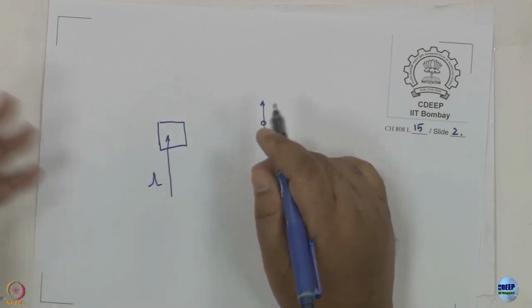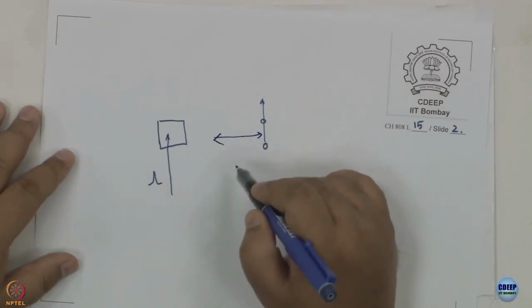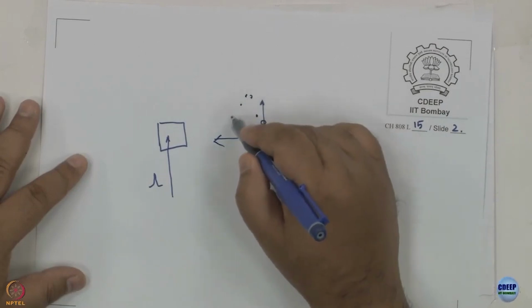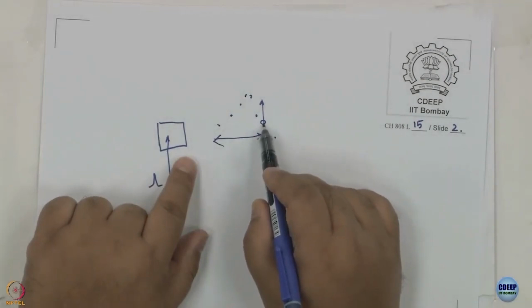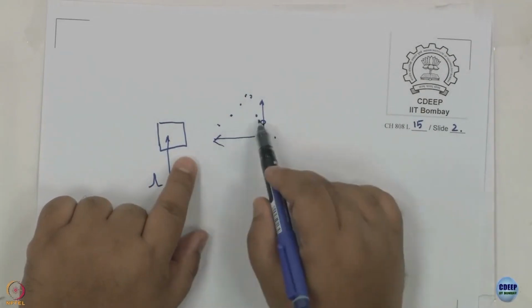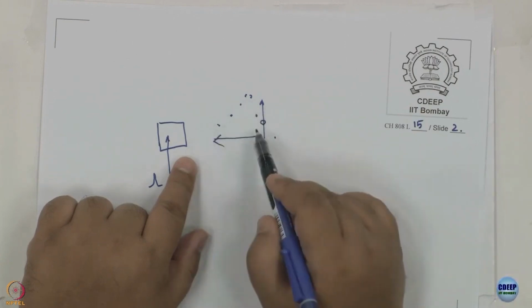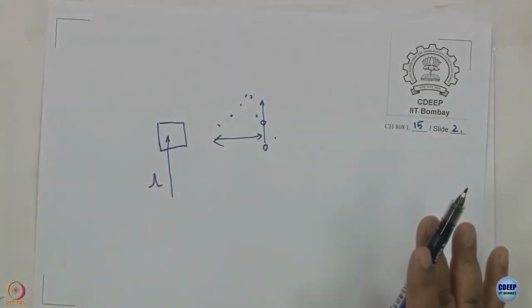When I say slower, I do not mean the photons are running slower, I mean they have been emitted at a longer time post excitation, okay. So, suppose I could look at this entire region, and I could see photons, then I would see a distribution like this, is not it? This is space, but photons that have been emitted first would have reached here, photons that have been emitted after some time would have reached here, photons that have been emitted even later have reached here, and so on and so forth. So, does this not look like a fluorescence decay? And is that not the histogram that we have been trying to construct all along? Yeah. Do you understand what we are saying?